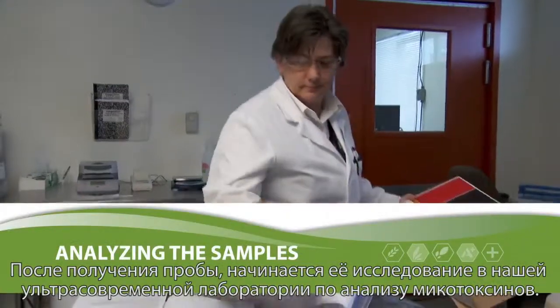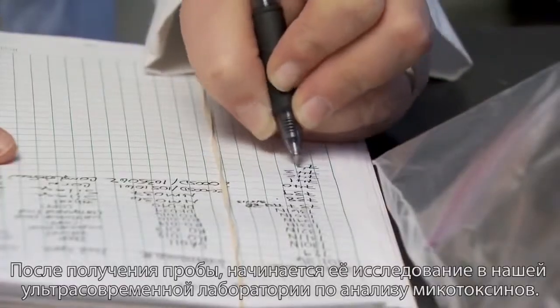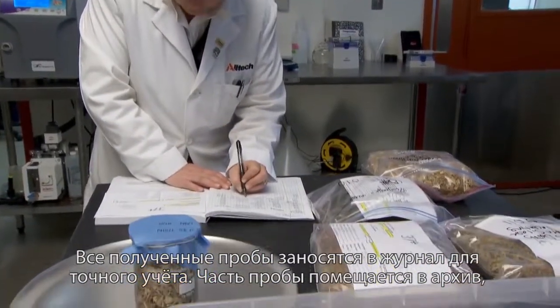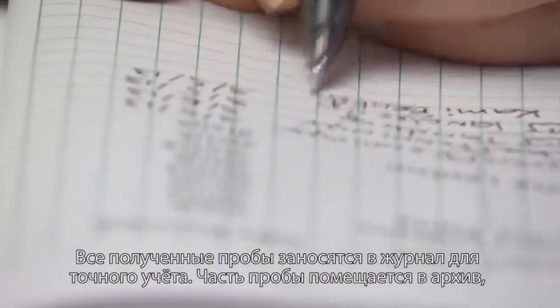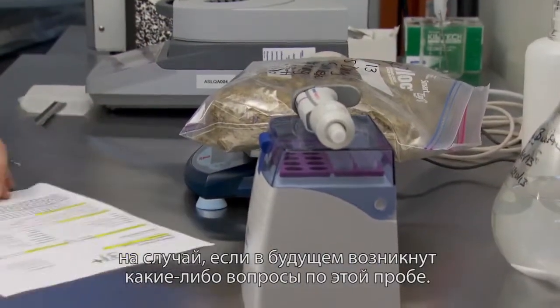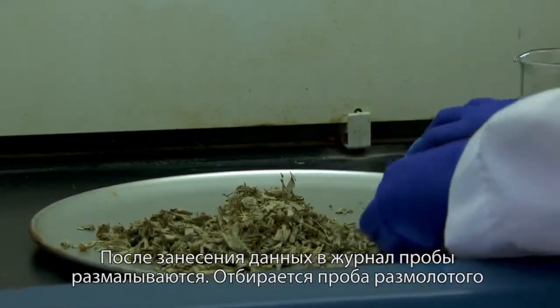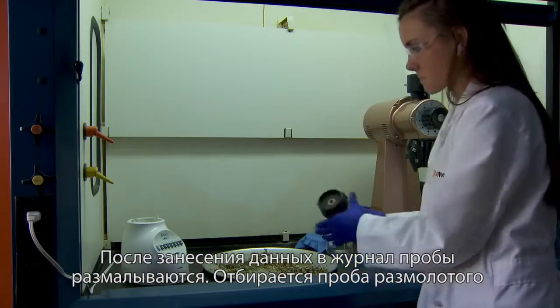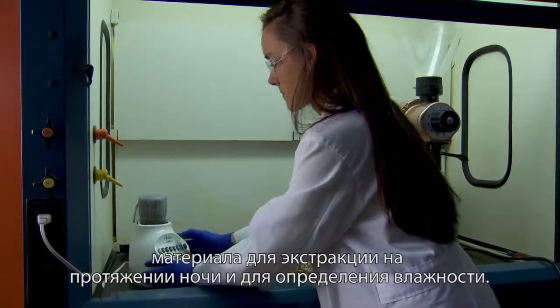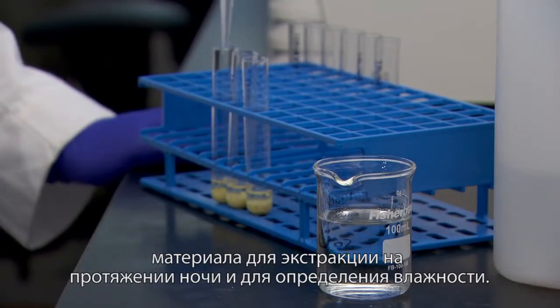On receiving the samples, our state-of-the-art mycotoxins analytics lab goes to work. All samples received at the analytics lab are logged in for accurate record keeping. A portion of the original sample is archived in case questions arise about the sample at a later date. After samples are logged in, they are ground in their entirety. Ground material is subsampled for the overnight extraction process and to test moisture content.